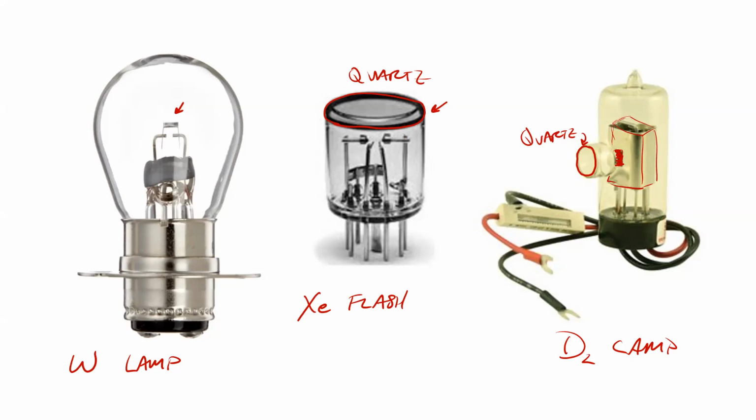And so these flash bulbs are quite small. I don't know if you can see it, but there's two different electrodes, right? There's one there and there's one there. And so we just arc a spark between those two, and that's what gives us our flash for the xenon. And we only have to do that a few times per second while we're taking our measurement.